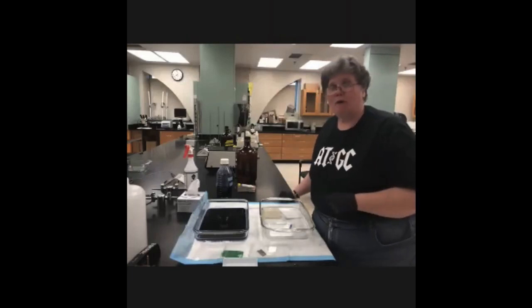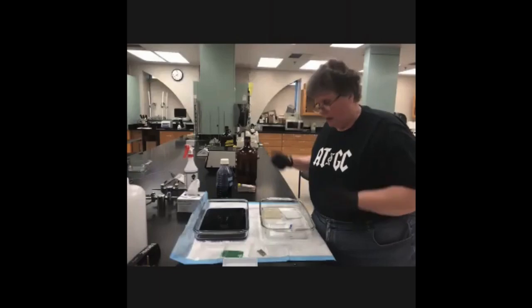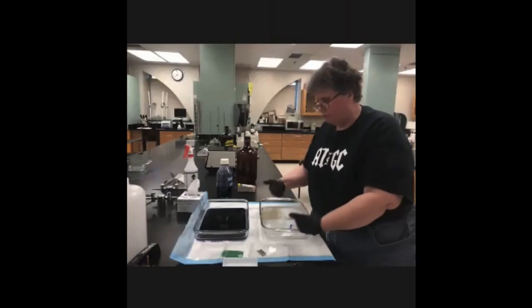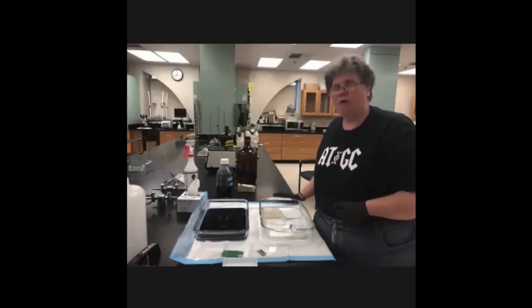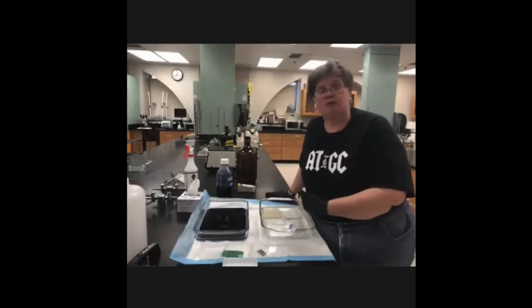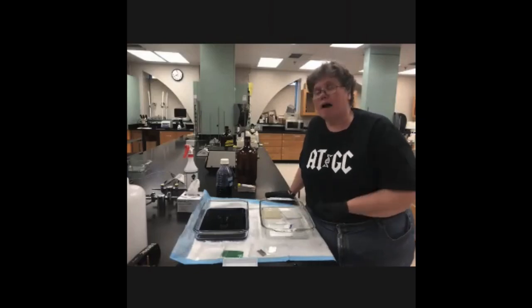By having 4 apparatus set up, you can run 8 gels at a time, and you can have all 8 gels sitting in buffer, ready to be soaking in the transfer buffer, ready to be transferred over to PVDF membrane. So you can make yourself very efficient. So if you're doing research in a lab, or if you are in industry, you are very often doing more than just one at a single time.